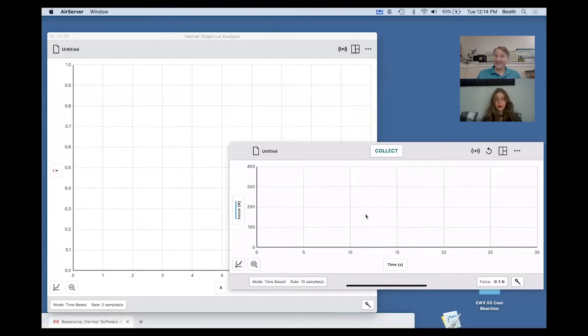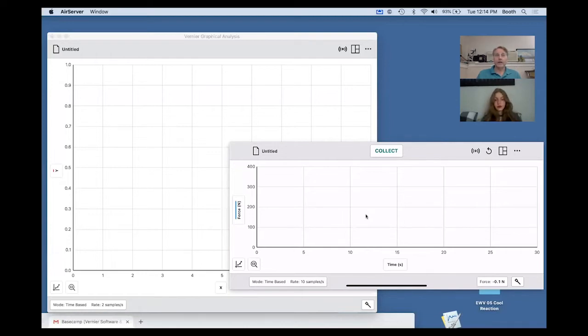It's called Data Sharing, and it allows you to collect data in real time and share with others over the internet. Maybe you are sharing with students you're working with in a virtual environment.